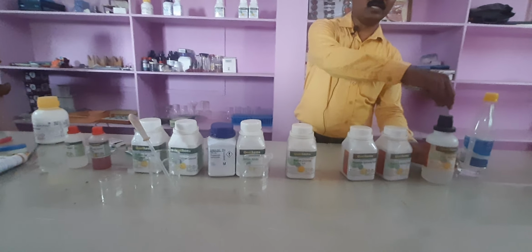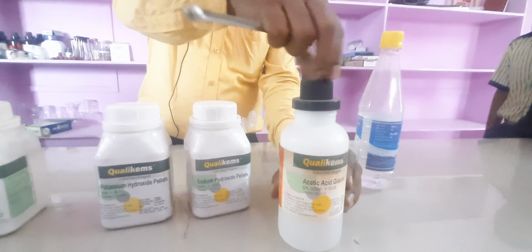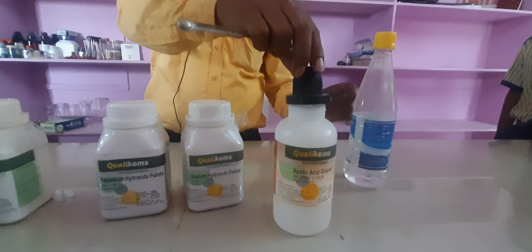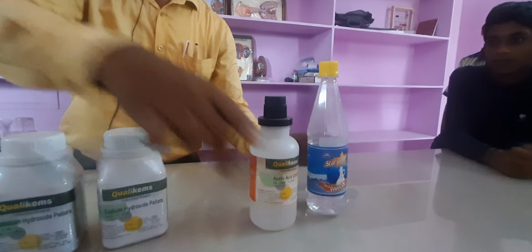This is acetic acid. This is one of the acetic acids. It has a pungent smell, so that's why we will test the acid by using the litmus paper. This is vinegar, a common product which is also available in shops. So these two we are using for the acids.